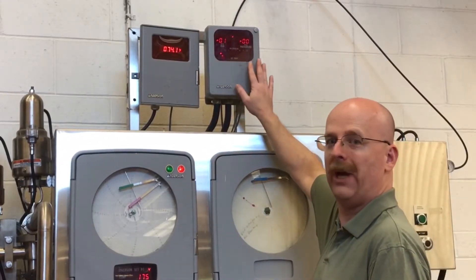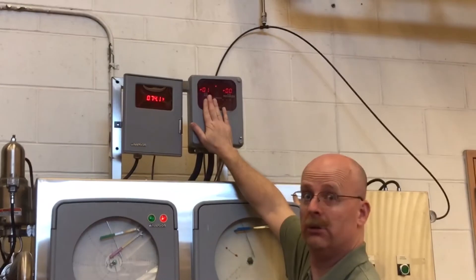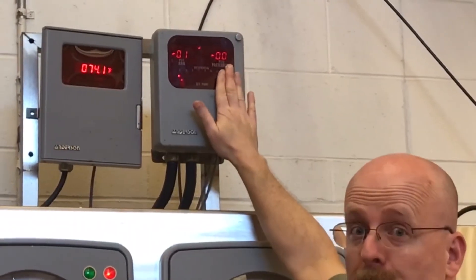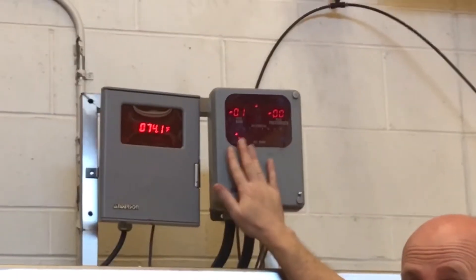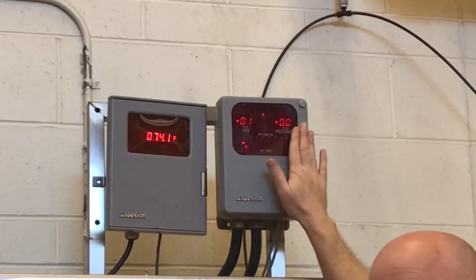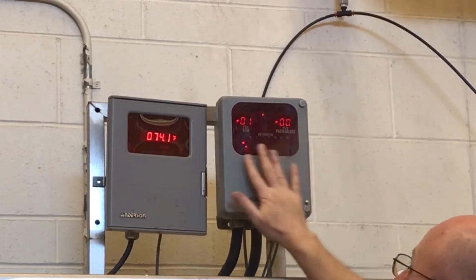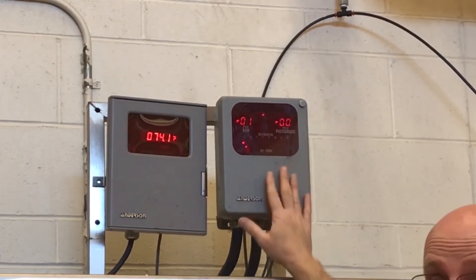We are monitoring the pressures here — we have our raw pressure and our pasteurized pressure. We are looking for a minimum 2 PSI differential, with the pasteurized milk at a higher pressure than the raw milk. This display is showing zero right now because our system is not operating.